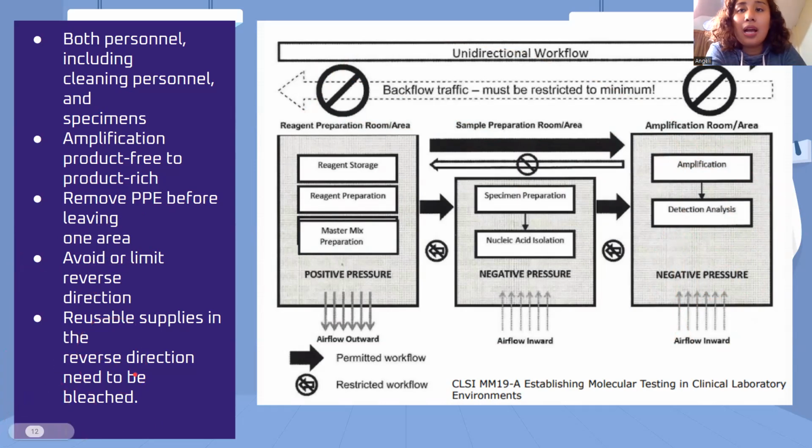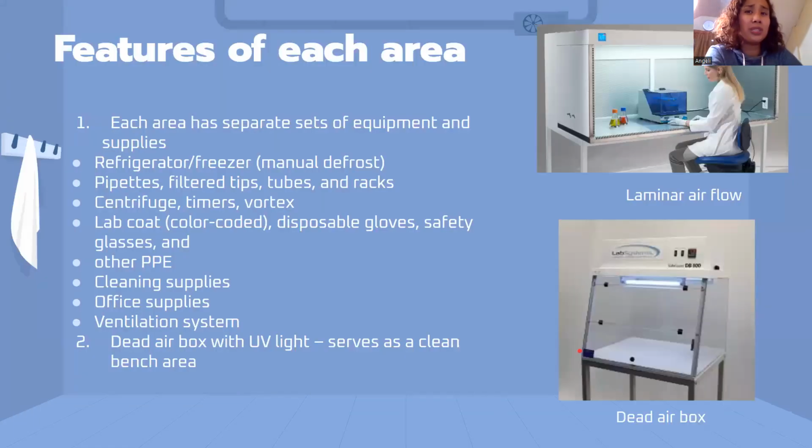10% sodium hypochlorite. Ma'am, so ba't sa school, mga balik-balik tayo? So, that is just a study, molecular bio area, teaching molecular lab. Pero, so magiging strict rin tayo dyan sa unidirectional workflow. Kasi hindi tayo kasya sa laboratory. Pag may holding area na tayo, siguro we would do that.